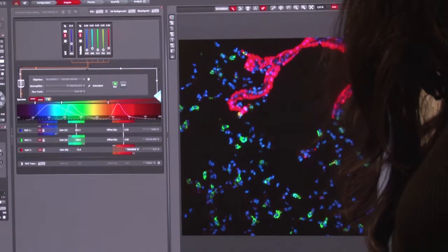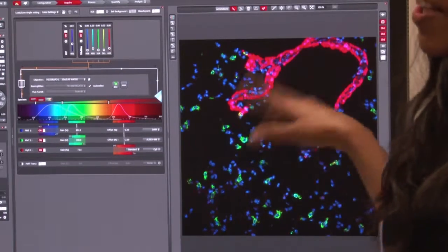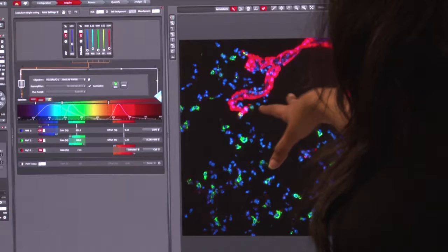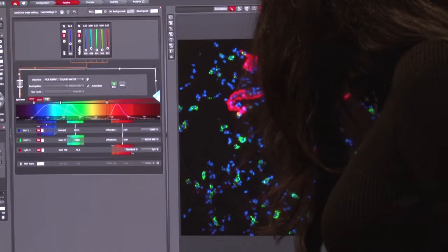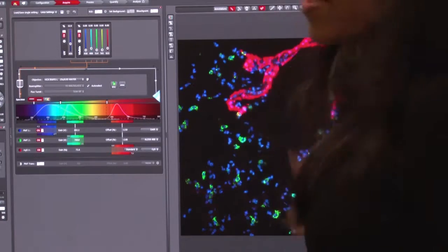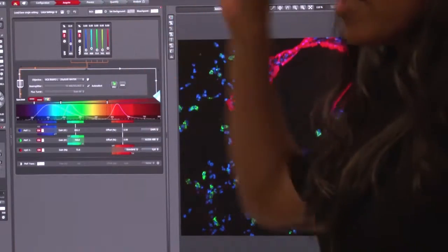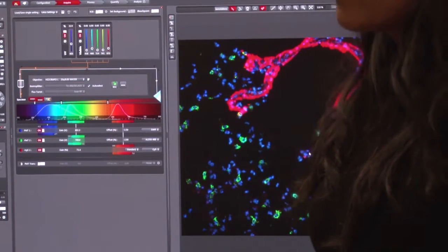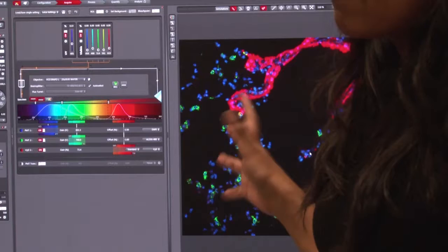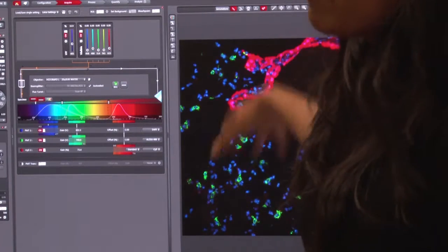Here, these genes are expressed at very high levels, so you're not seeing individual puncta. There are some, which you can see here, but this is not something that's normal for every gene you would look at. If your gene was moderate or rare, then you would start seeing individual puncta. So that's typically how it looks. It looks very similar to how your immunostaining would look if it's super abundant.